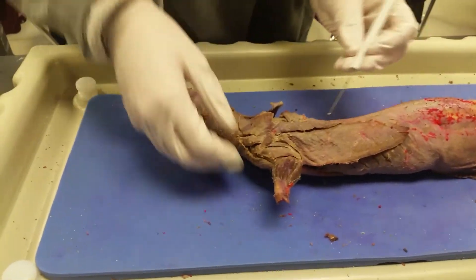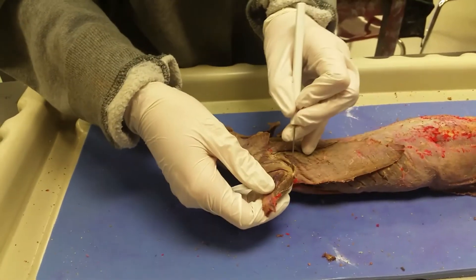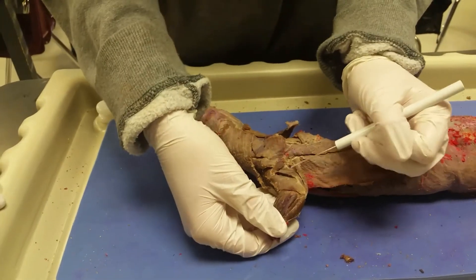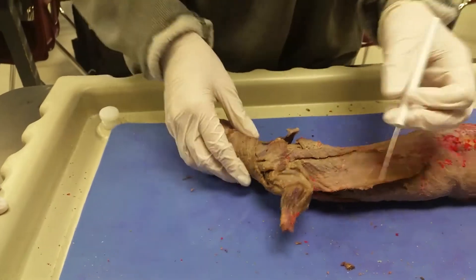The first upper arm muscle that you can see is the dorsal epitrochlearis. And then next to them are the two triceps muscles, both branches — triceps brachii, right there.